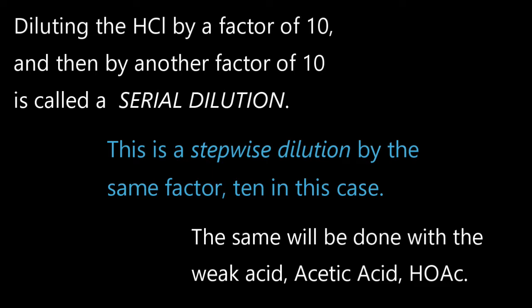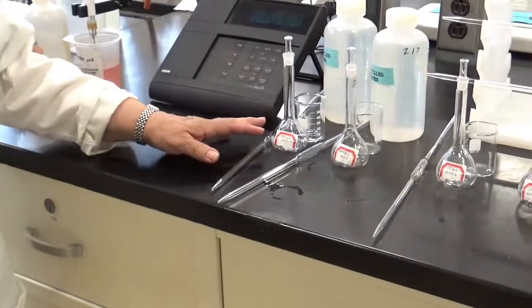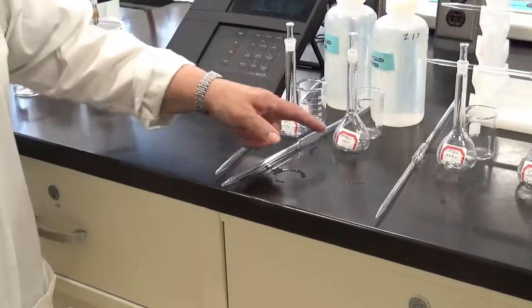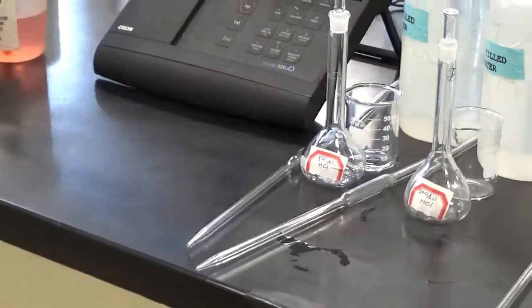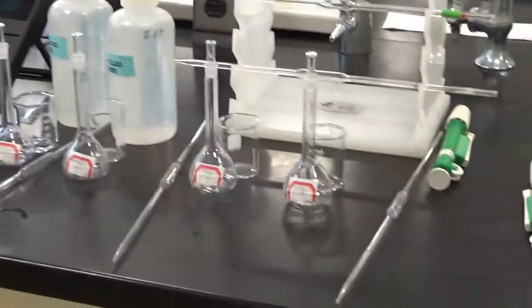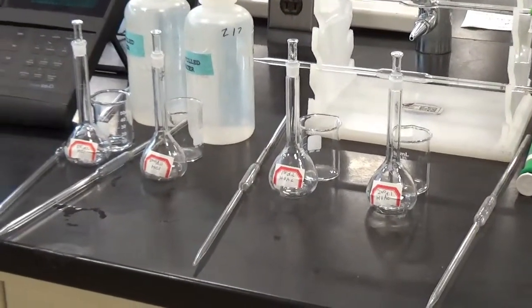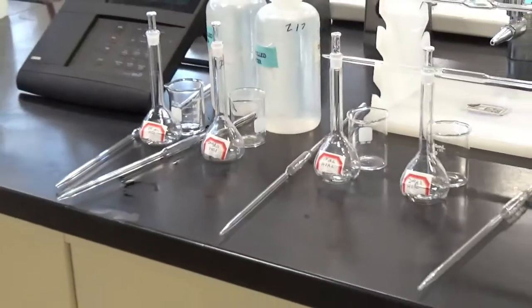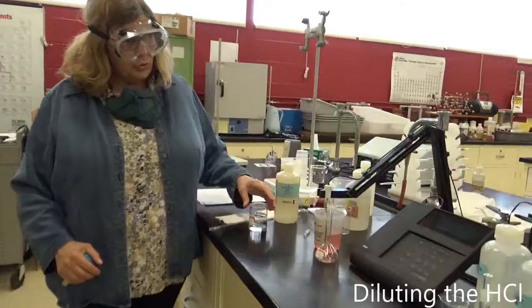We're going to do it with the HCl, and then again with the 0.1 molar HOAc. I'm going to reduce the concentration of the HCl each time by a factor of 10. Then I'm going to do the same thing for acetic acid, which is the weak acid. I'm going to make the dilutions, and we're going to measure the pH of each of these solutions and record that in our data.